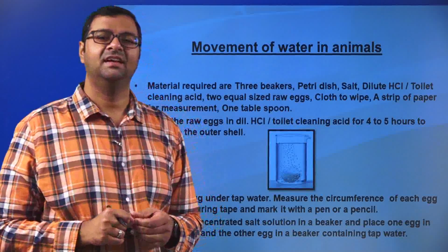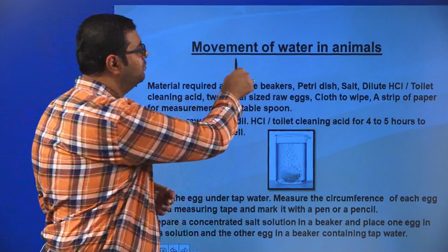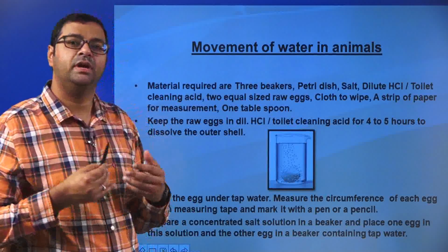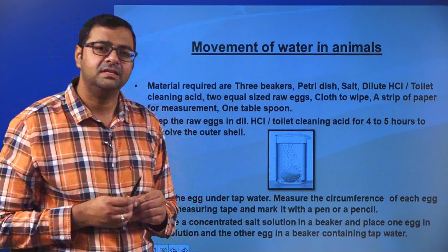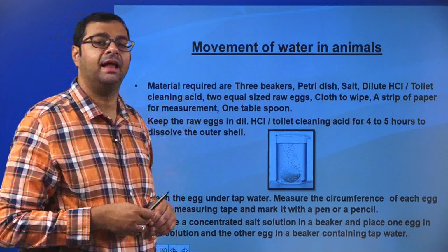Hello children. Today we will be looking at an experiment which is movement of water in animal cells. In your previous classes you might have learnt what an animal cell is. Now in this session we will be looking at movement of water in animal cells.